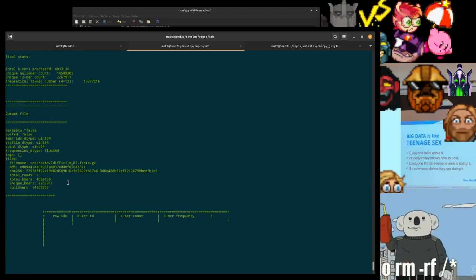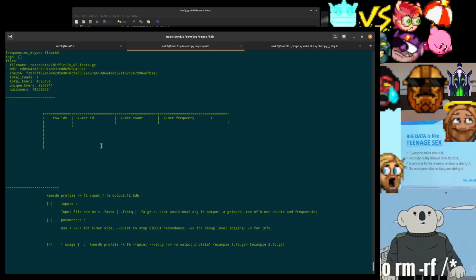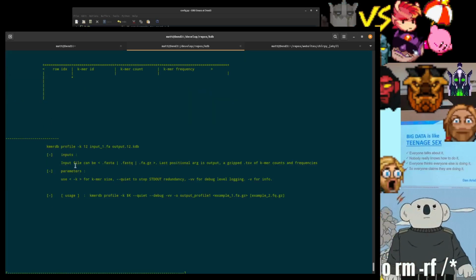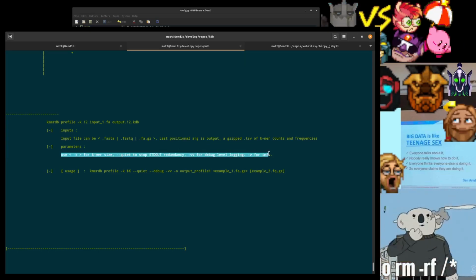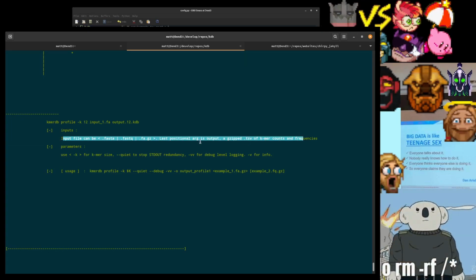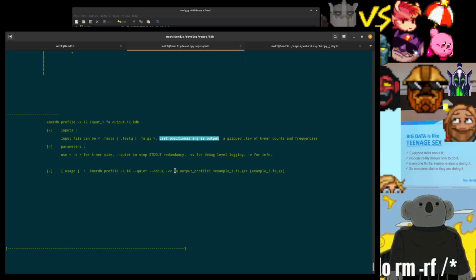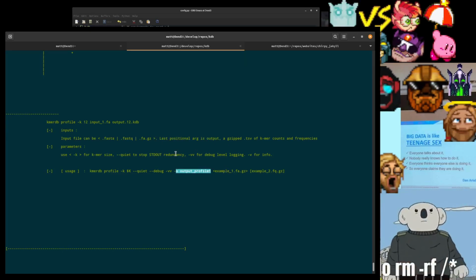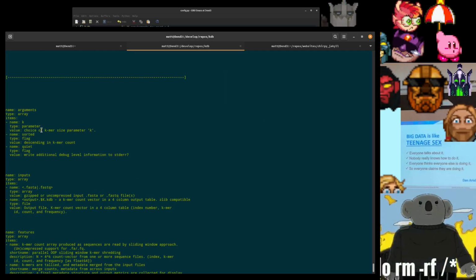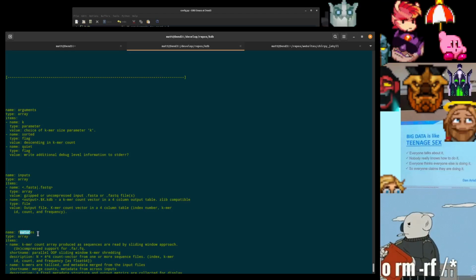And this is an example of the YAML header that gets produced. And then kind of a table. It reiterates some of this stuff again. It describes certain key parameters, key inputs. This is outdated. I'm using the -o, as we can see here. I'm no longer making that the last positional argument. And then a description of some of the things like arguments, inputs, features.